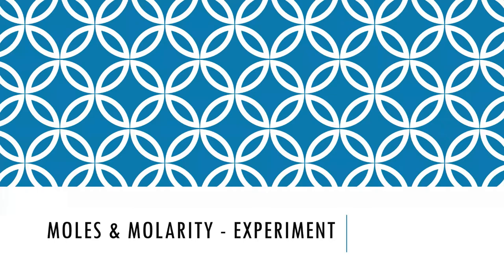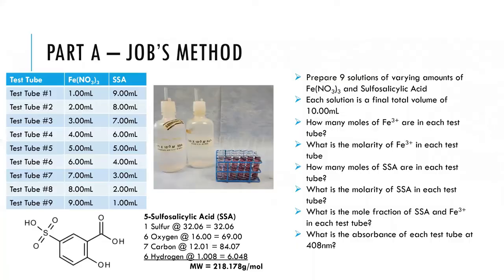In the experiment itself, in lab, you'll be preparing and diluting a number of different solutions. From these solution preparations, you're going to be looking at the molarity of the varying solutions, and the moles contained in each of them. In the first part, at least, use these ratios, these combinations of moles, to determine the empirical formula of the product. In the first part of the experiment, this is what's called Job's method. You're going to be combining two different solutions in varying amounts and recording the intensity of the purple color from the product.